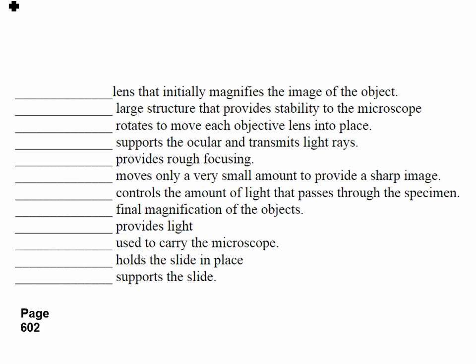Final magnification, all right? And I'm going to put here ocular, and I don't like these descriptions because I know what you're thinking. You're thinking, there's light coming from this specimen, right? And you're following the light up, so it magnifies first, right? But if you're thinking of it like you're looking down, it doesn't really, and that's why I don't really like the way this one describes it. So, like I said, I like the way you're thinking because when I initially did this sheet, I thought, I like that idea, but you could think of it the other way. So this is really kind of ambiguous.